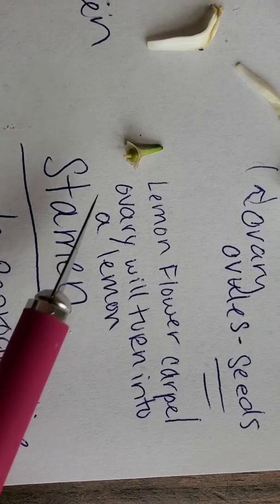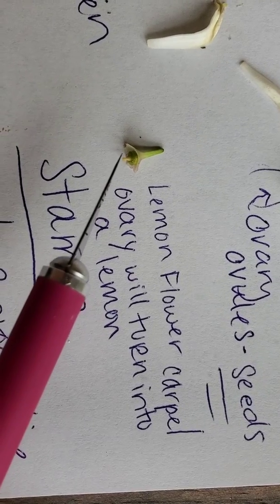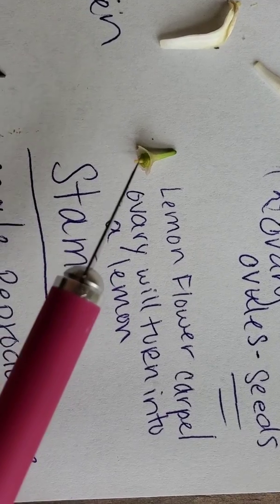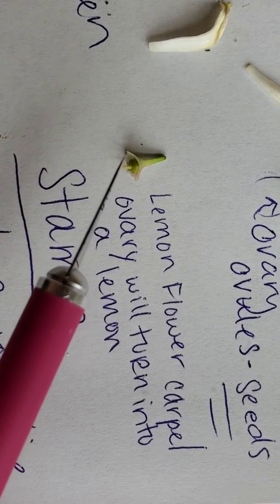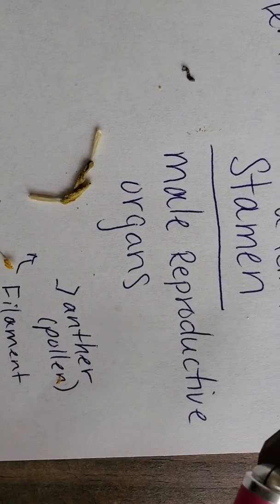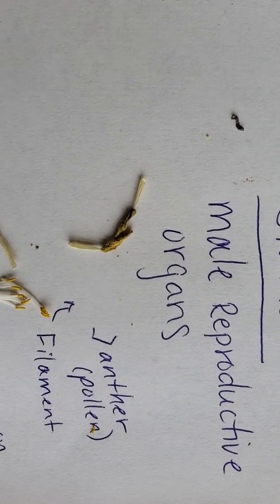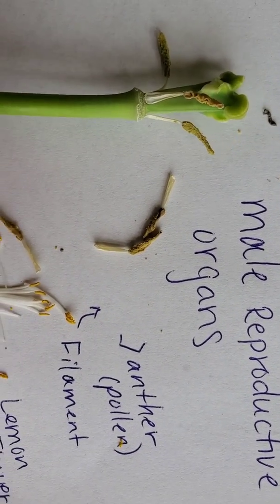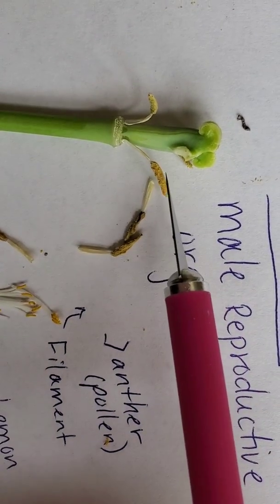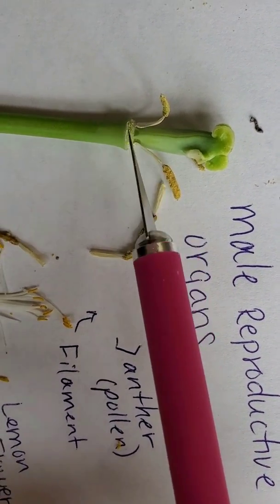And then here's a lemon flower. These are the petals that go with it. The lemon, you can see the carpel right here. And once this actually gets pollinated, this whole thing will start to turn into that lemon. And again, here's the stamen, the male reproductive portion. And you've got your anther, which contains the pollen. So before you cut it all up, this is the tulip, kind of looks like. You can see where the anther with the pollen, the filament, stigma, the style, and then the ovary would be down here.